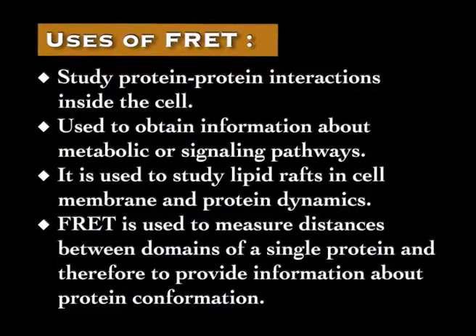Now, FRET is widely used in biology to see in vivo protein-protein interaction, to see the dynamics of the membrane, to see the lipid rafts, as well as to see multi-protein interaction and the trafficking of different proteins from one part of the cell to another.